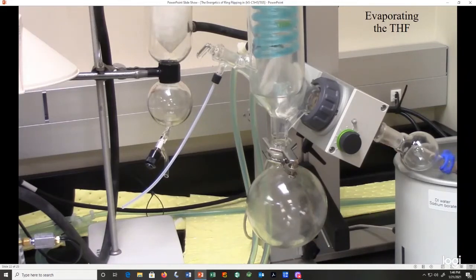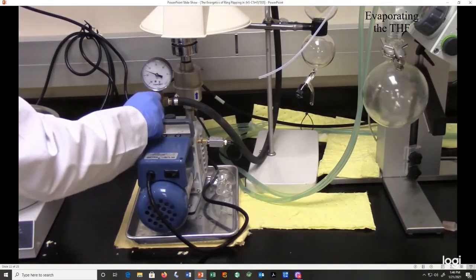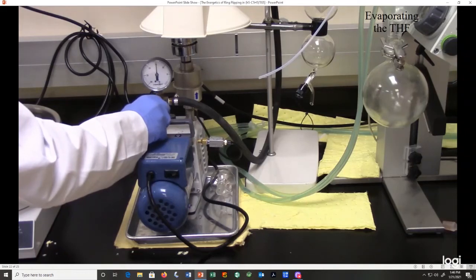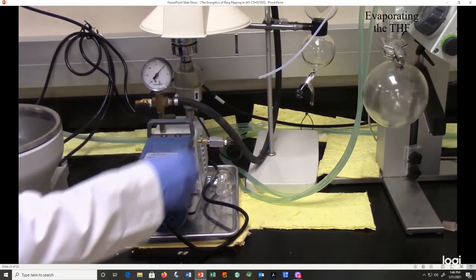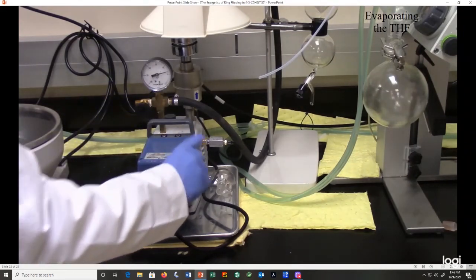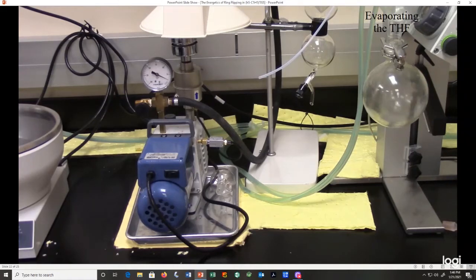So we're going to fast forward this a little bit until we get to the point where we're pretty much done with the evaporation. So at this point, we can open that system up a little bit to the atmosphere, and we can turn the vacuum pump off, and we can retrieve our product.